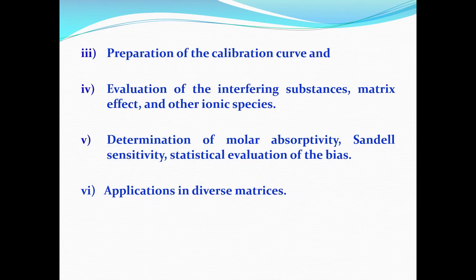And then you also want to determine how long the color is linear with respect to absorbance, because that is the essence of Beer-Lambert's law. In Beer-Lambert's law, we make a plot of absorbance or transmittance versus concentration.